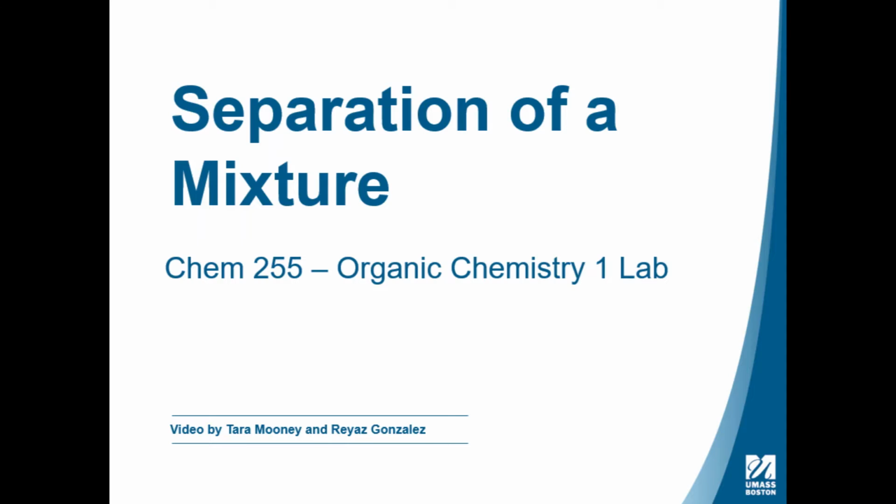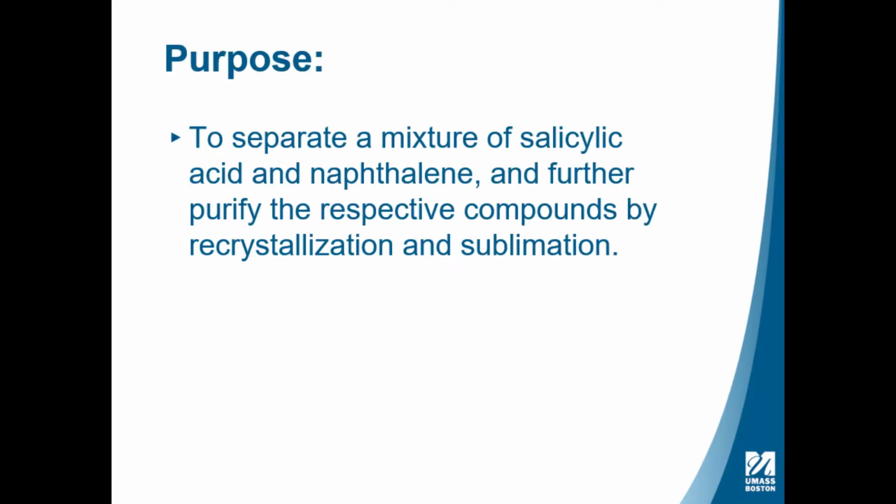Hello class, today we will be performing the separation of a mixture. The purpose of today's experiment is to separate a mixture of salicylic acid and naphthalene and to further purify the respective compounds by recrystallization and sublimation.